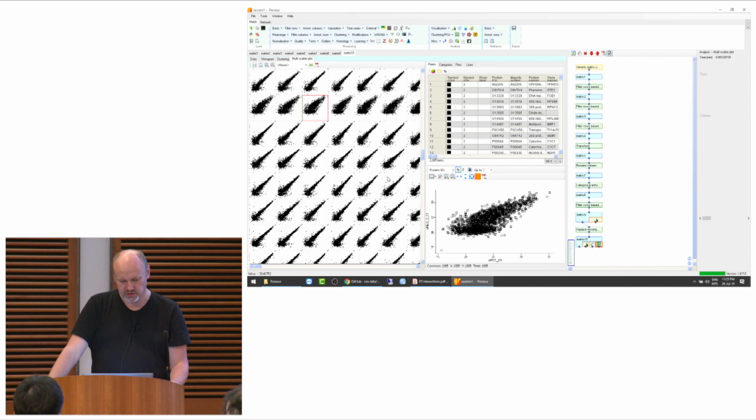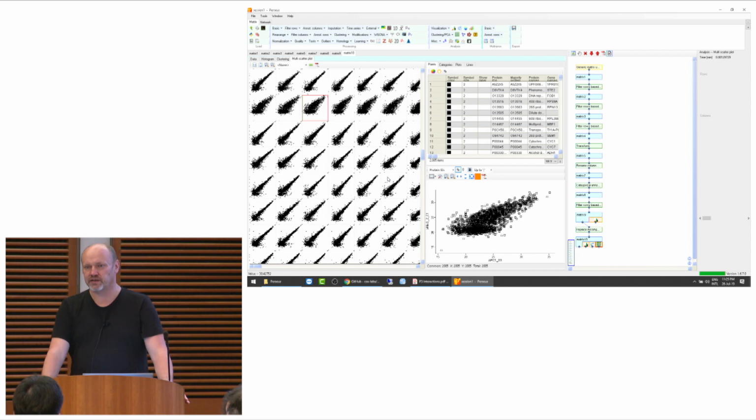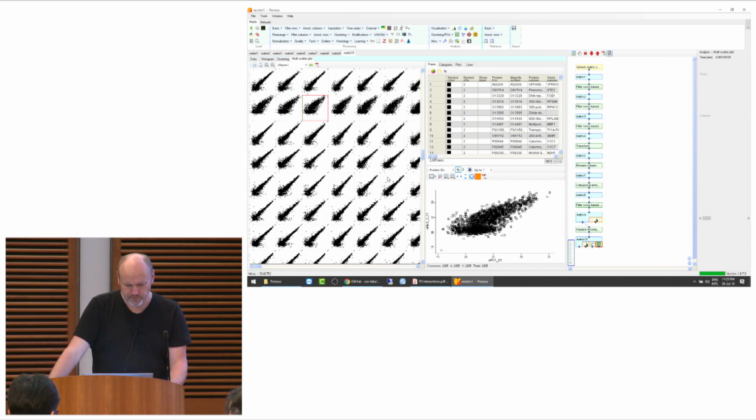So usually, if everything is normalized well, then it shouldn't make a big difference if you calculate that based on the whole matrix or on single columns. And that should be the case, right? Either everything is going well and you don't need normalization, as it is here, or you need normalization, then you should do the normalization also, right? And then it makes basically no difference if you calculate the normal distribution on all samples or on samples separately.